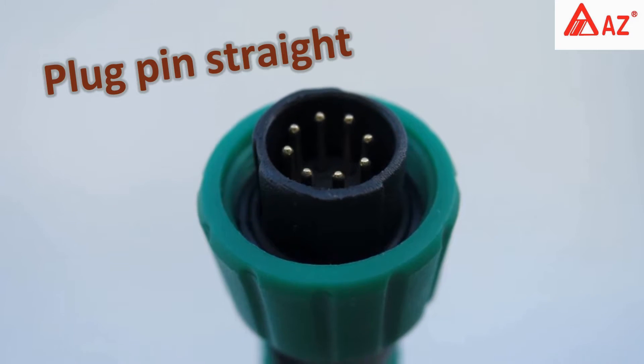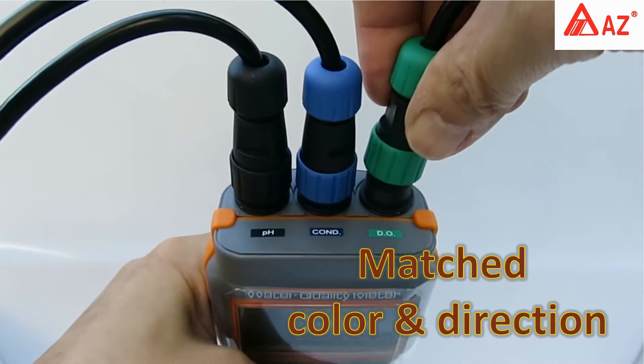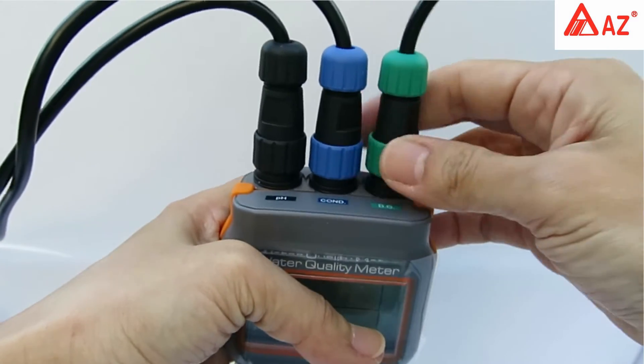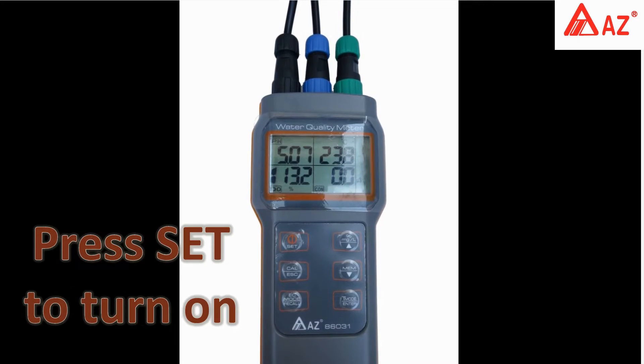Plug the pin in straight. Find the installation guide between plugs and sockets with matched color and direction, then plug and screw in. Lock it down with the lock screw. Press the Set button to turn on the meter — the reading will display on the LCD.